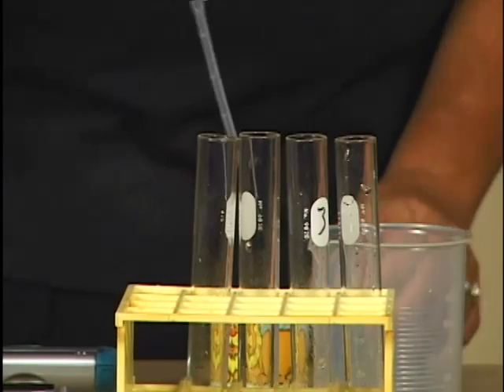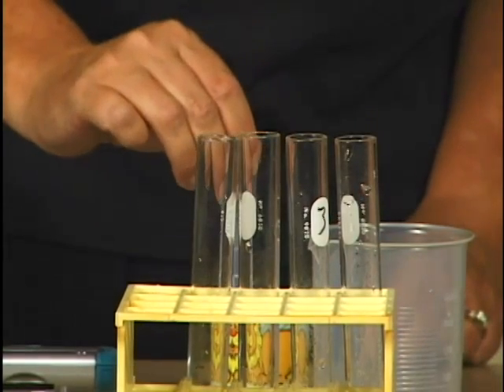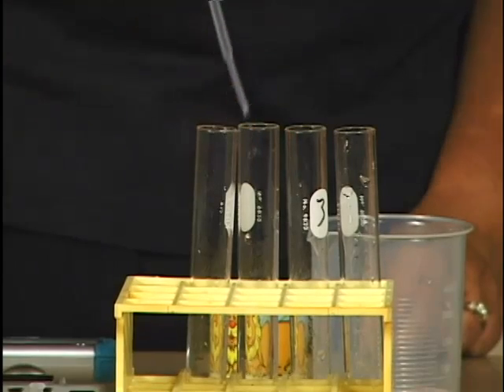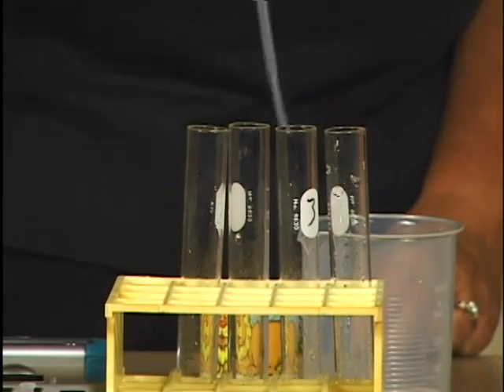Similarly, add three milliliters of three percent hydrogen peroxide to each of the test tubes in your rack.